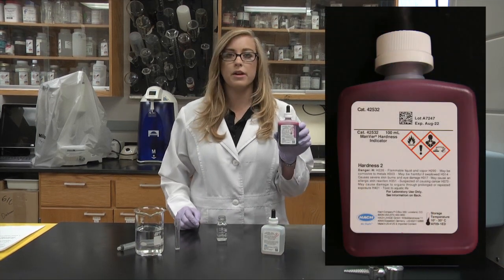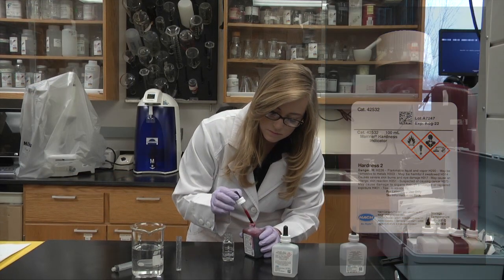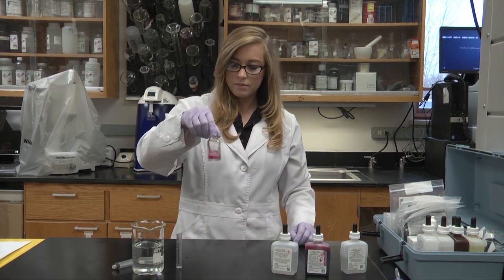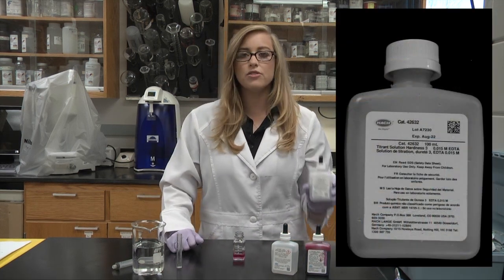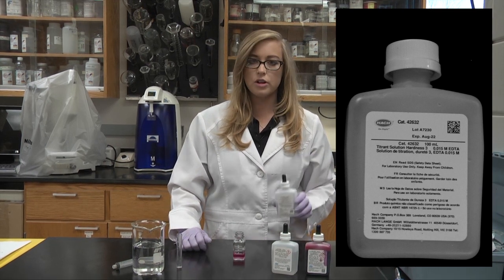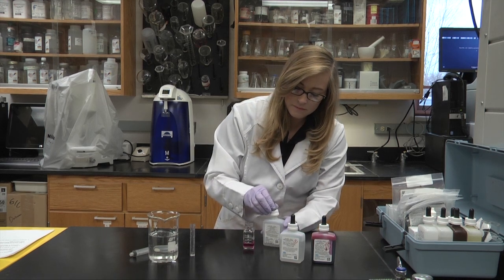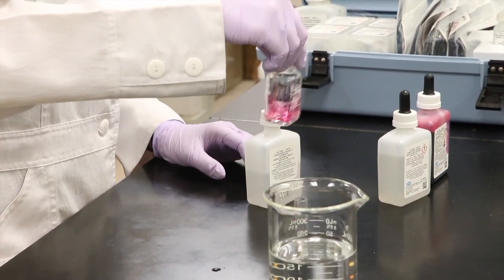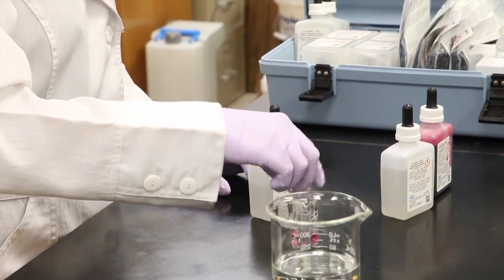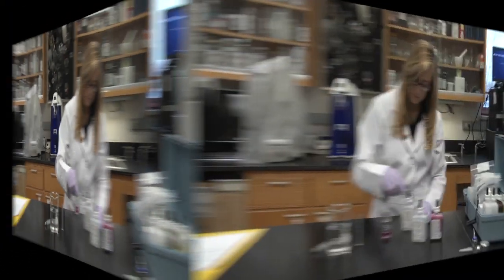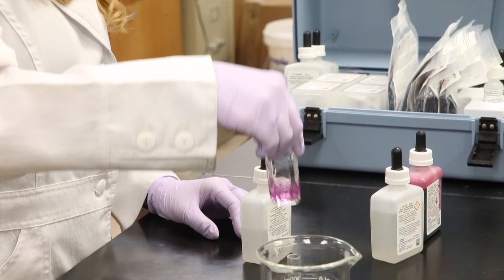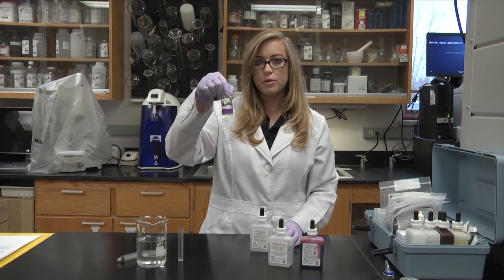We will now add one drop of the ManVer hardness solution two, and then swirl to mix. Now we add the titrant reagent, hardness three, and we'll count this drop by drop until we get a color change. And that was 16 drops. It changed from pink to blue. And then to get your hardness in milligrams per liter, you would multiply that by 17.1.